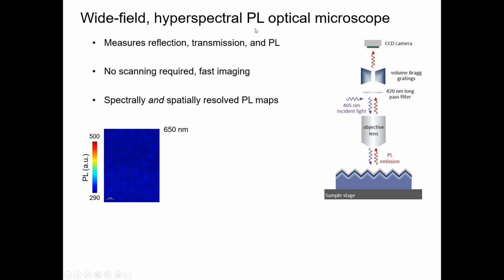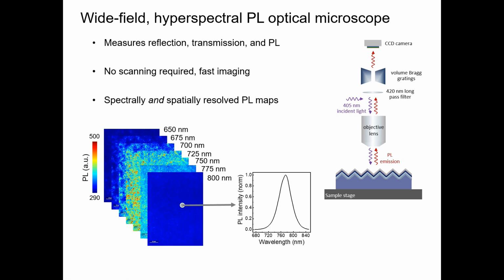We use photoluminescence mapping. So right now I'm showing you a sweeping of wavelengths to gather a local photoluminescence emission. And now what is that? What am I looking at here? Well, let me go into that a bit further, but this is the microscope that I'm using.